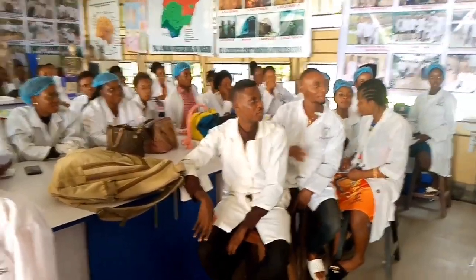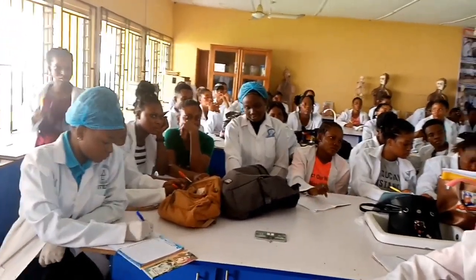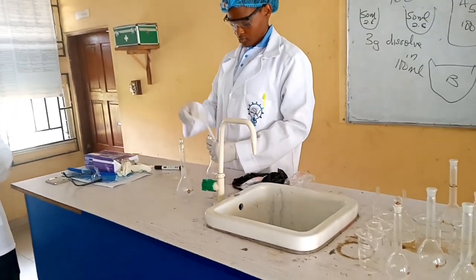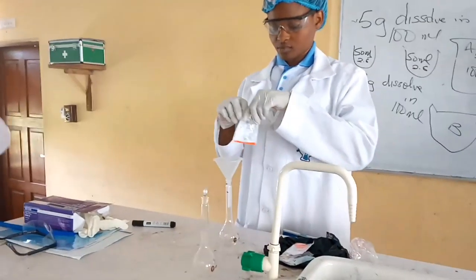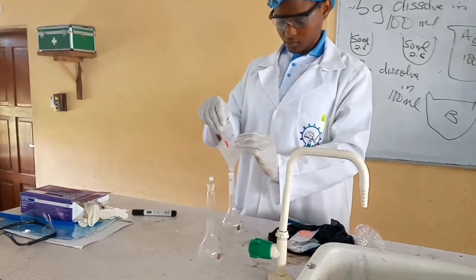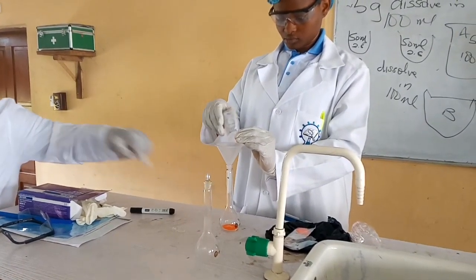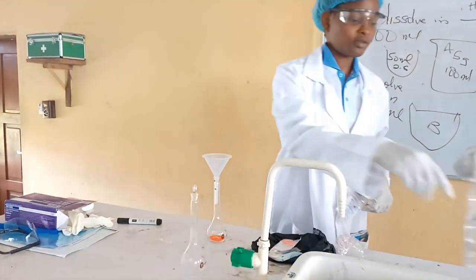So we have 5 grams here. This 5 grams, Blessing is going to be the one to do this. I'll be doing the explanation. She wants to put that 5 grams into that volumetric flask and dissolve it. The mark at this point here is the mark where 100 mil stops.